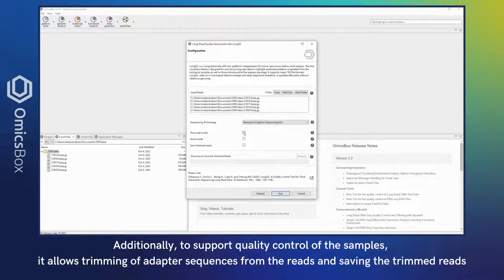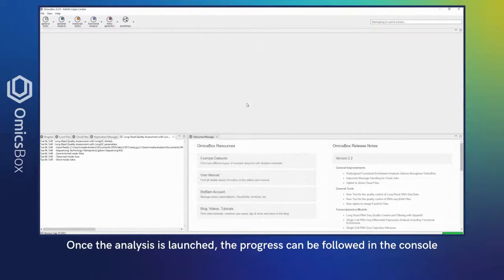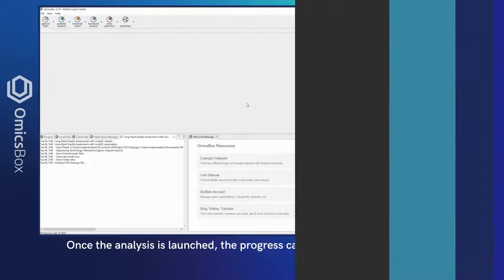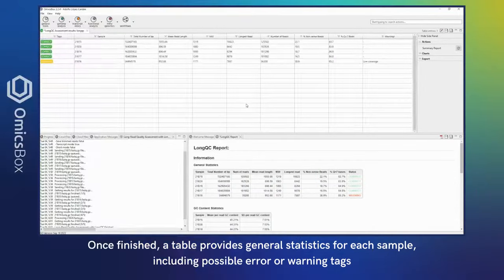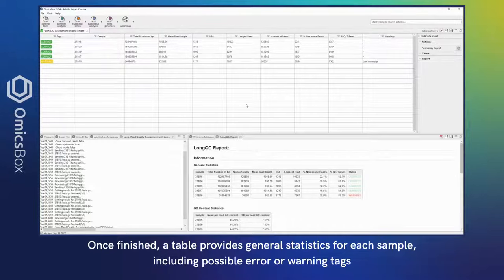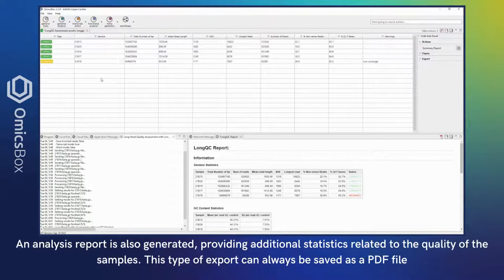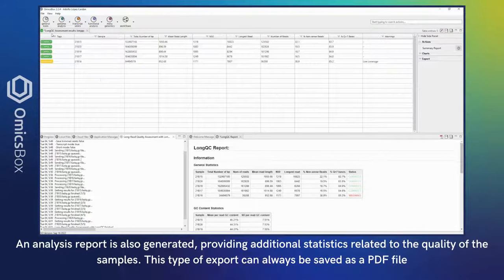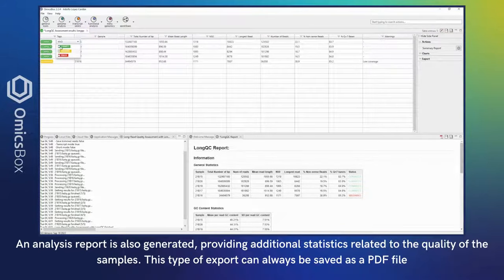Once the data analysis is launched, the progress can be followed in the console. Once finished, a table provides general statistics for each sample, including possible errors or warning tags. An analysis report is also generated, providing additional statistics related to the quality of the samples. This type of export can always be saved as a PDF file.